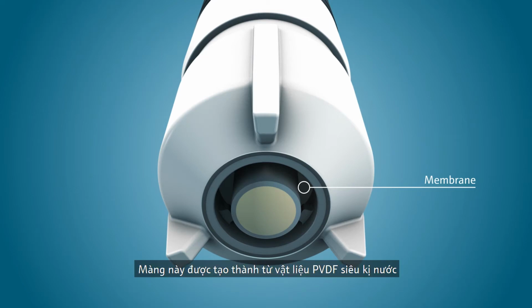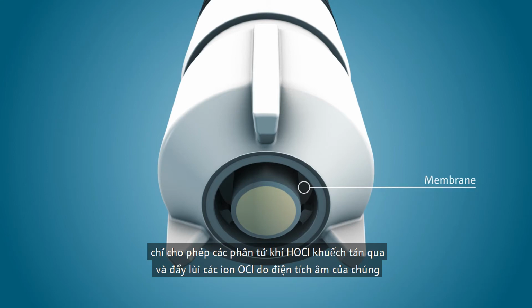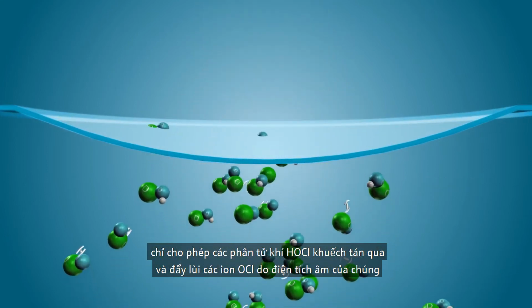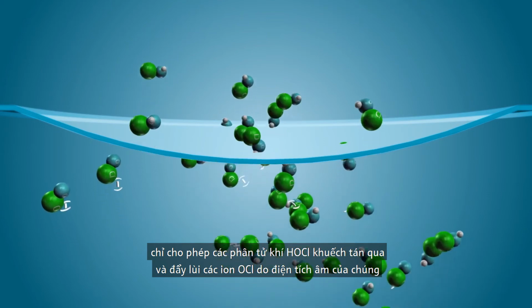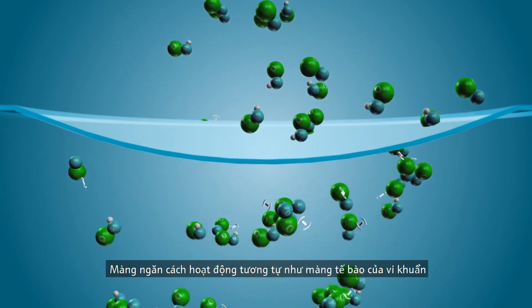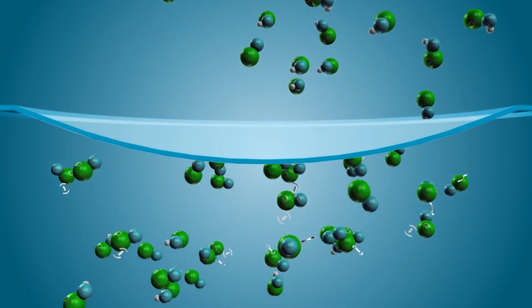The membrane is made of a superhydrophobic PVDF. It allows gaseous HOCl molecules to diffuse while it repels OCl- ions due to their negative charge. The membrane shows a behavior similar to cell membranes of bacteria, for example.